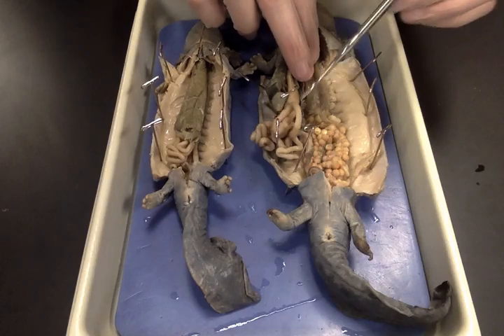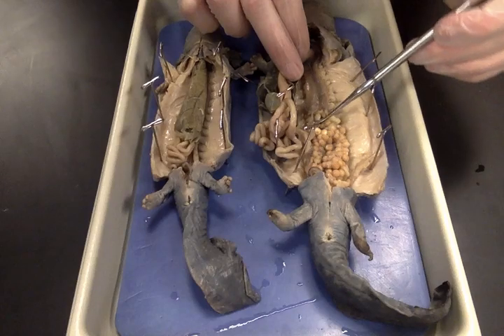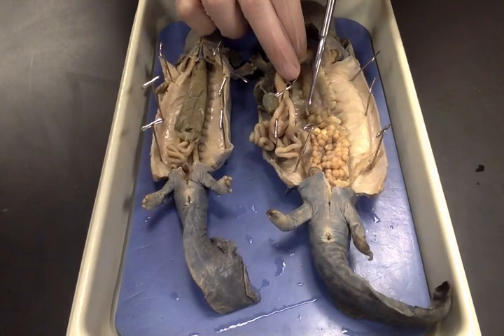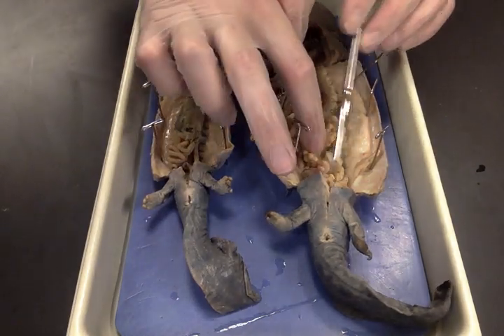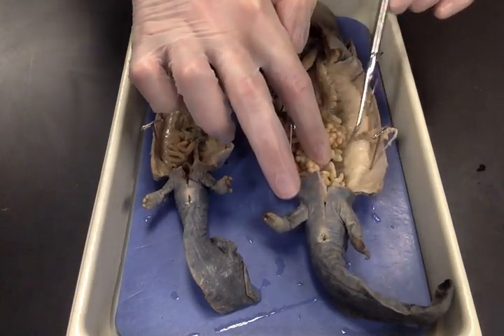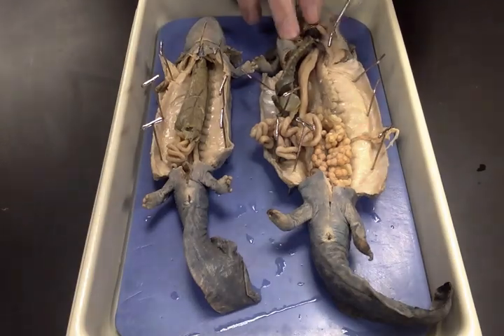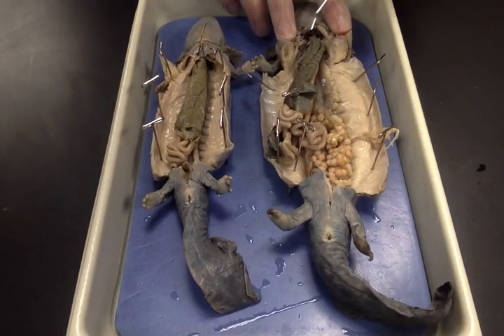Next to the stomach is the spleen — that's this dark structure here — which also aids in digestion. Underneath the stomach and the spleen are the two thin, almost completely transparent lungs. They're not very functional in these guys, which is why they're so thin. Below all the eggs you've got this frilly kidney; the kidneys are at the back body wall.